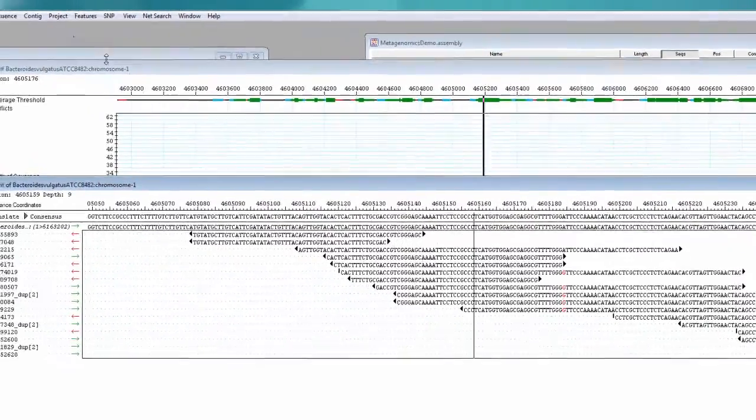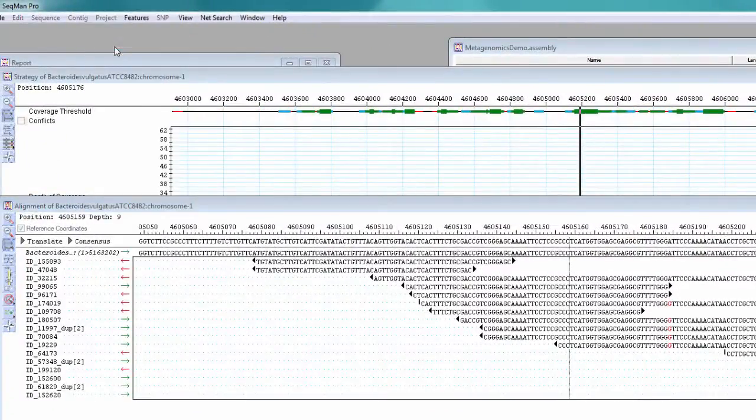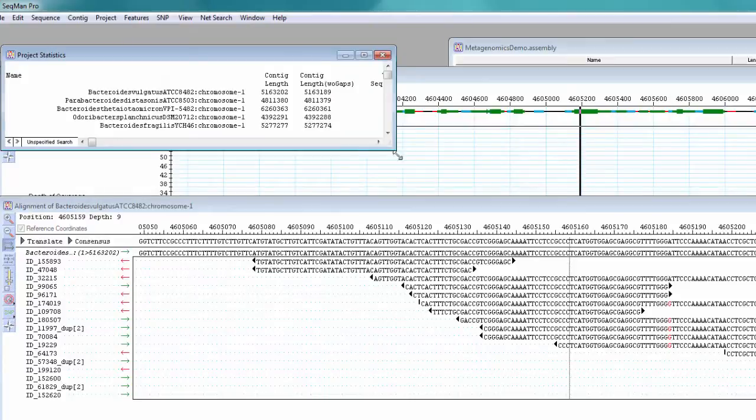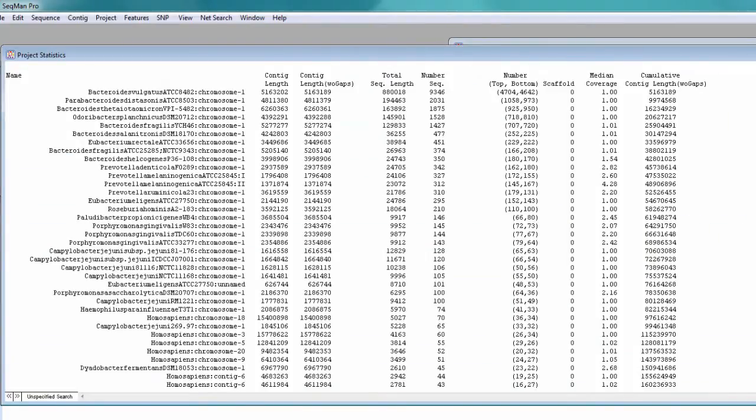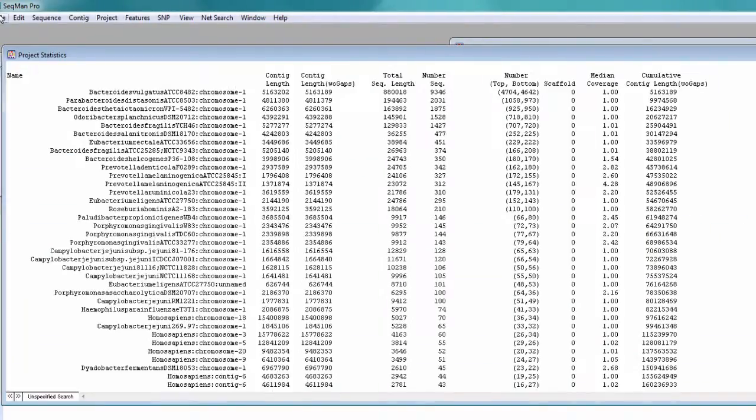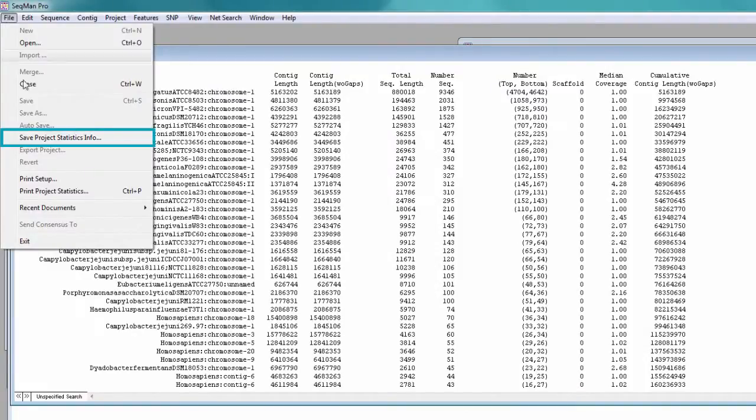You can also go to Project Statistics to view the results in a table, then save this as a tab-delimited file to import into other applications.